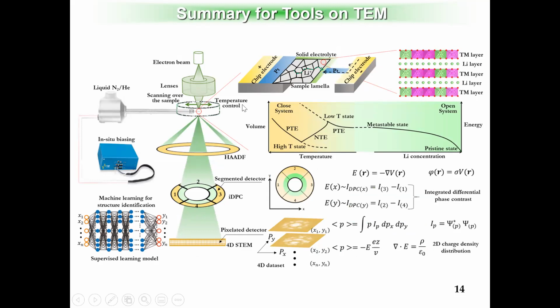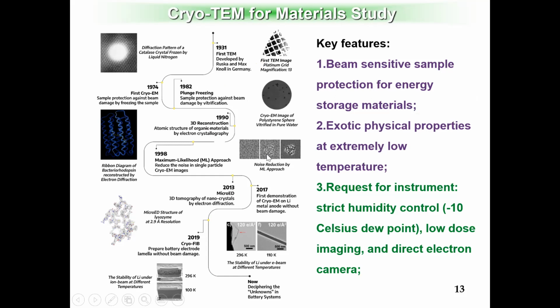Yeah. Can I ask one quick question on this last page? If I'm a scientist trying to do some TEM, how do I know if my sample might be beam sensitive, or sensitive to beam damage?